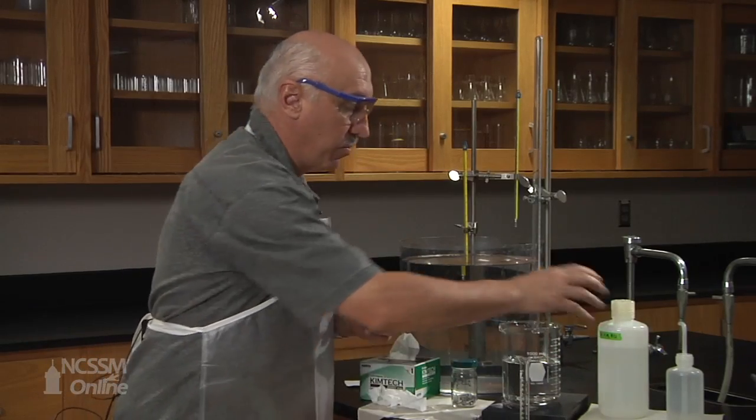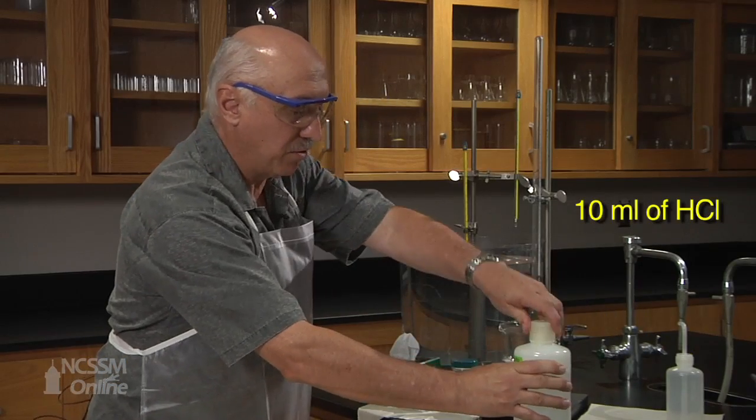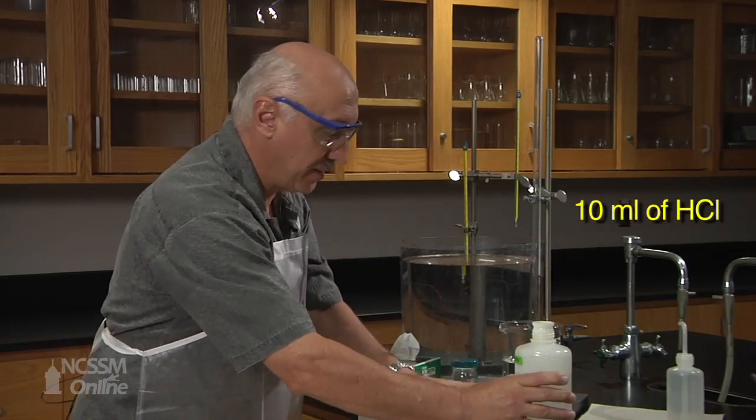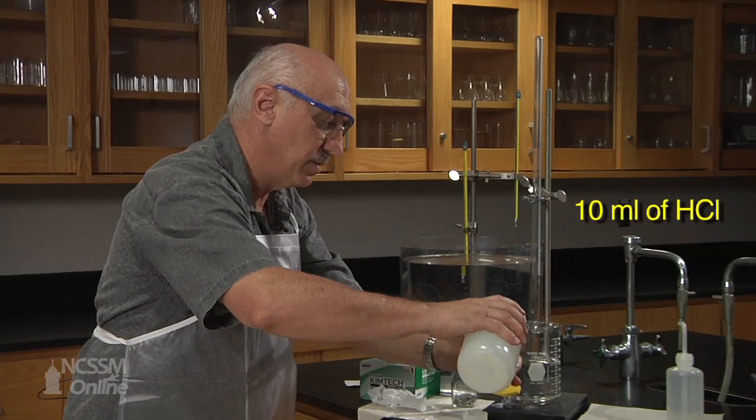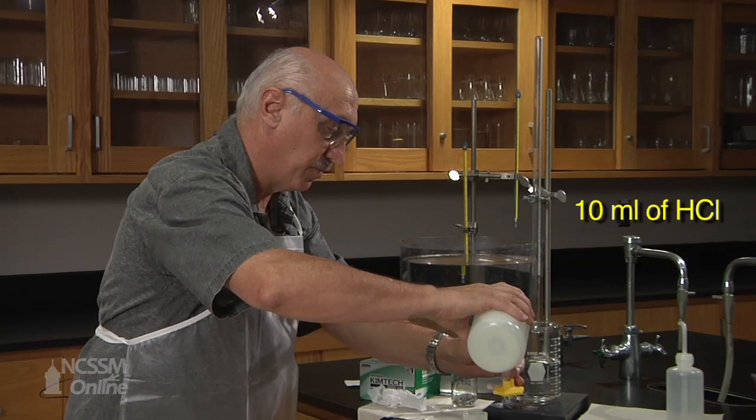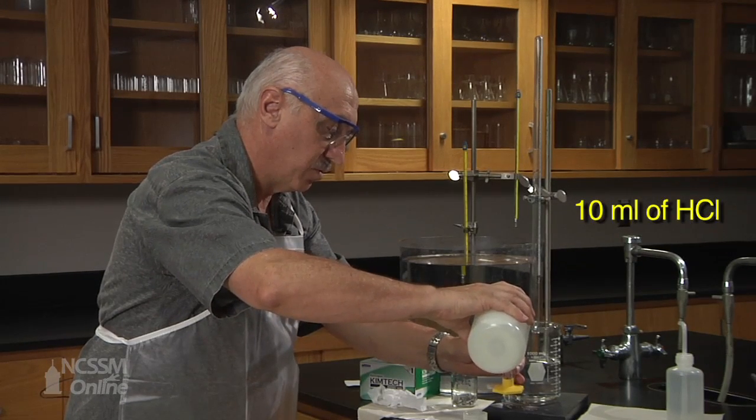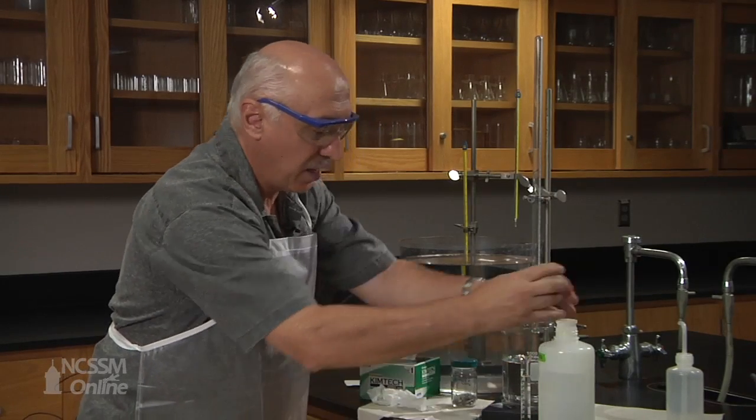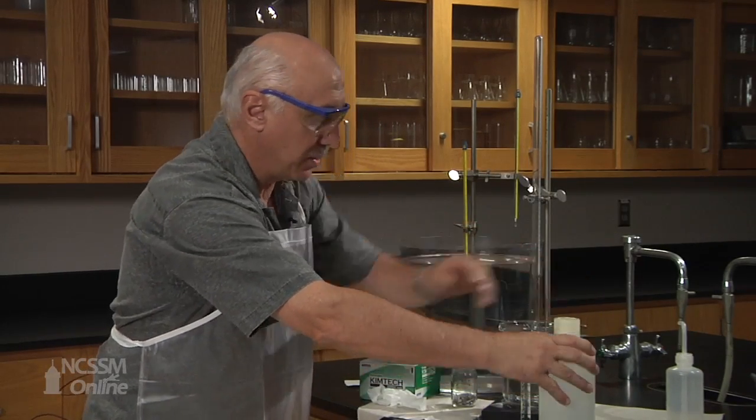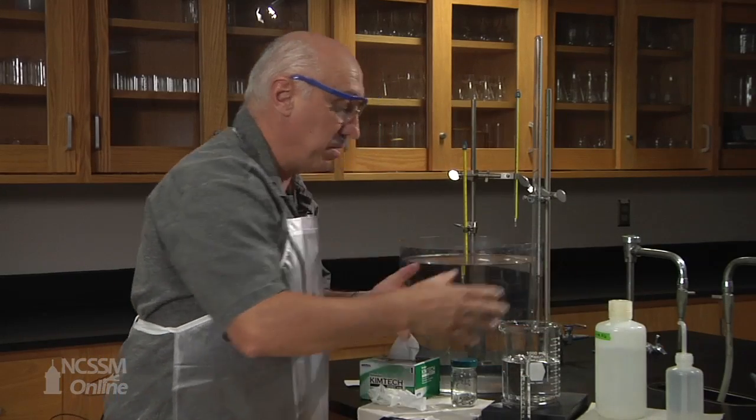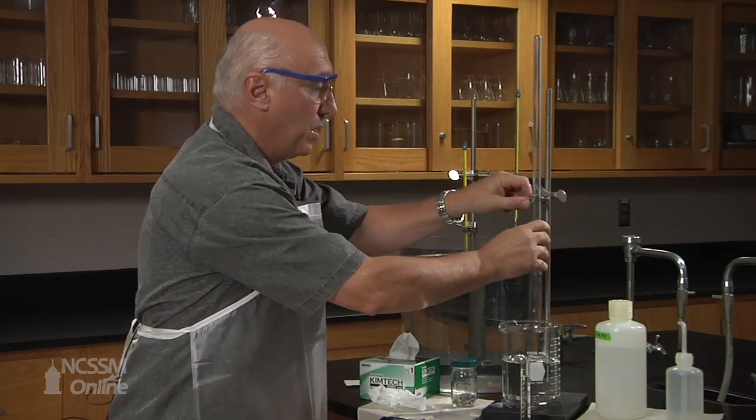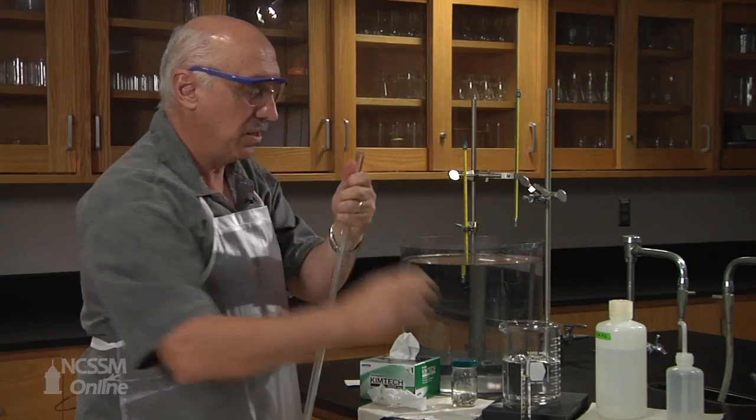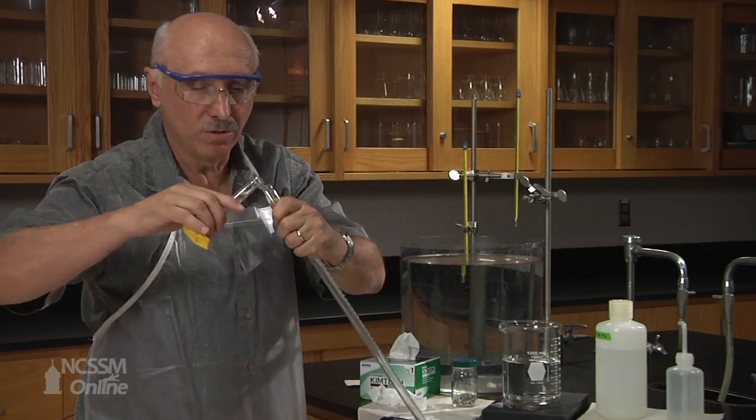So now we're going to pour our 10 mils of hydrochloric acid. Hydrochloric acid in this reaction with magnesium is the excess reagent. So that way we ensure that all of the magnesium will react. Now, it's not absolutely necessary that it is 10 mils, approximately 10 mils. We will pour the 10 mils in our gas measuring tube.